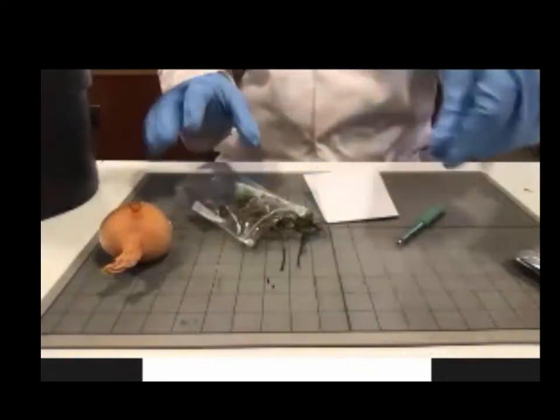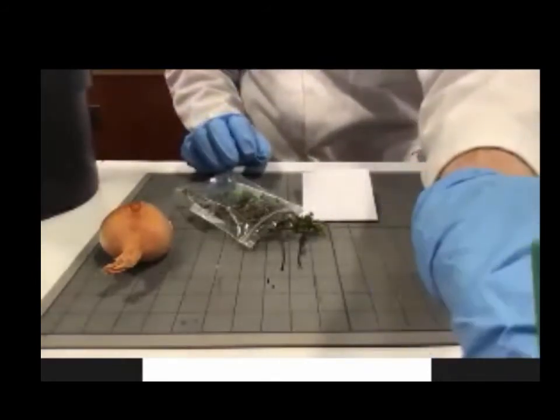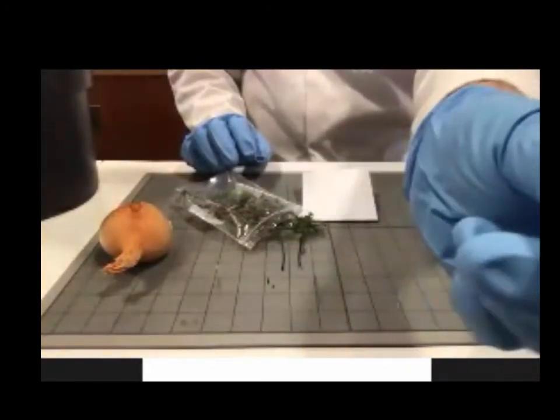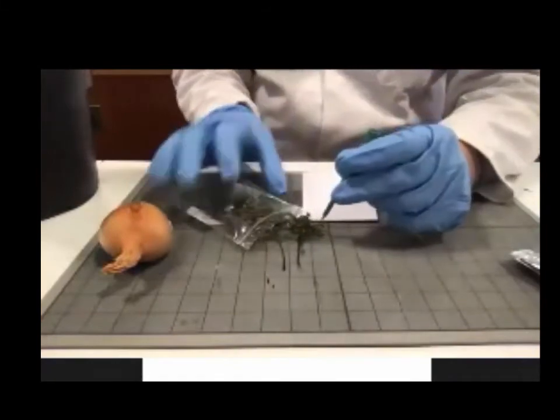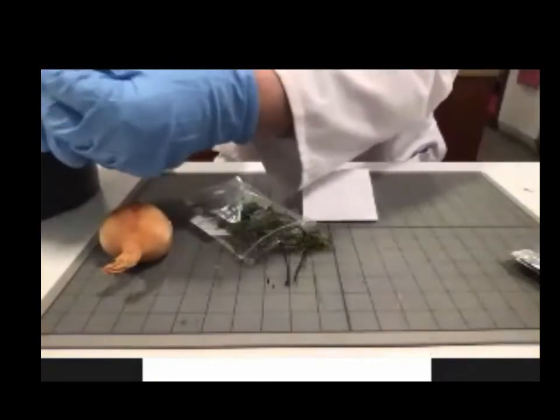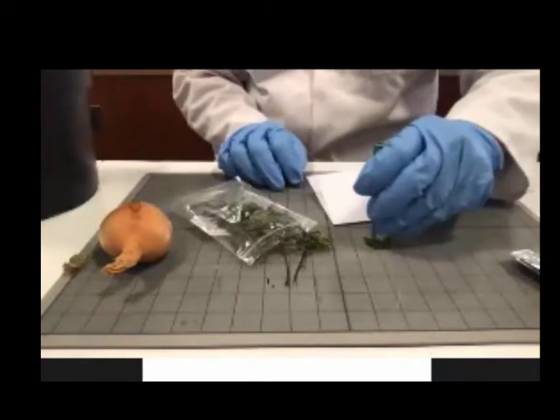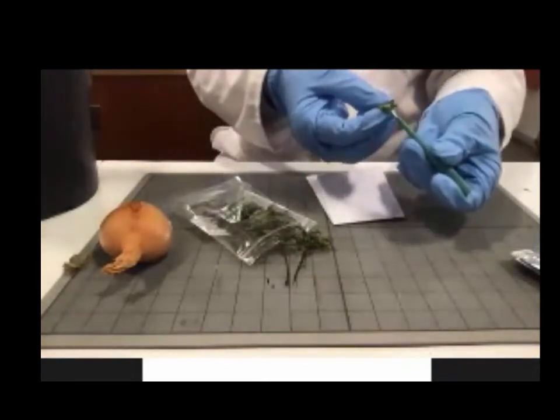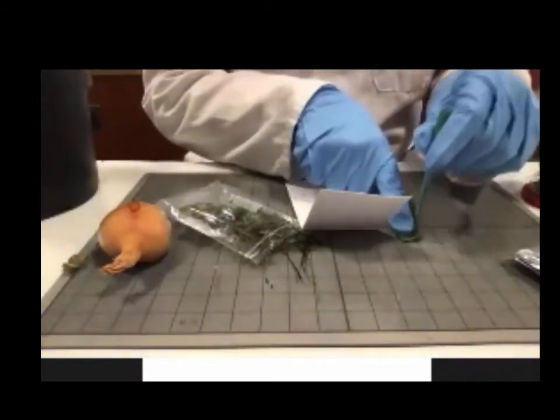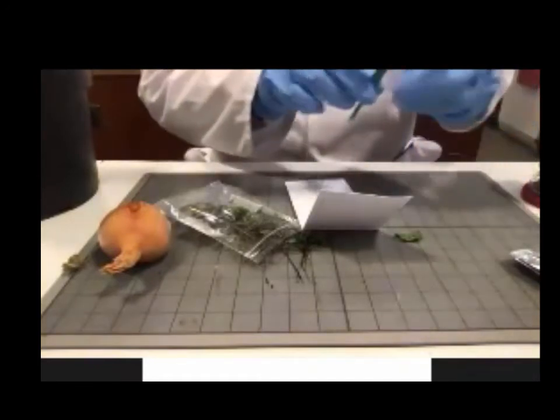Now, what I'm going to do is use this, which is a biopsy punch. I get a leaf, and I'll demonstrate it with this leaf first. We get it here, and we take a punch. The trick is not to go too hard on it.